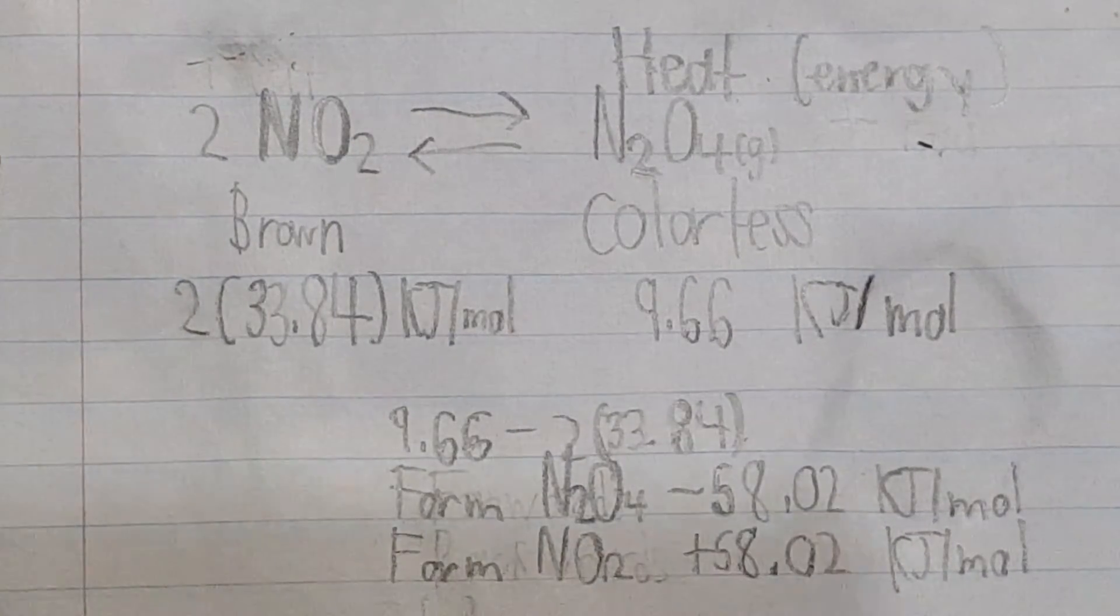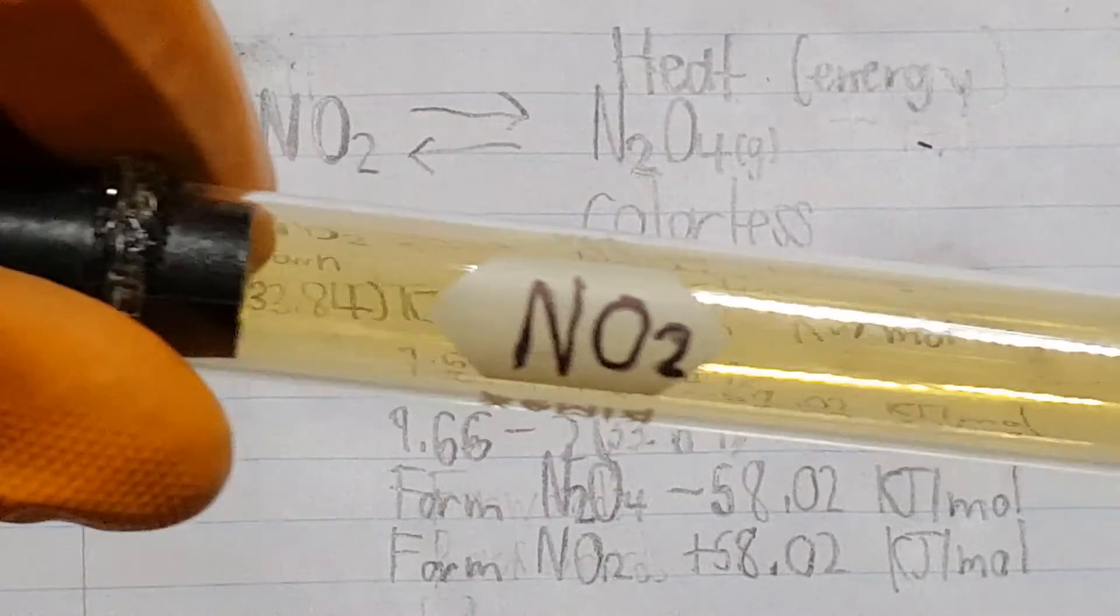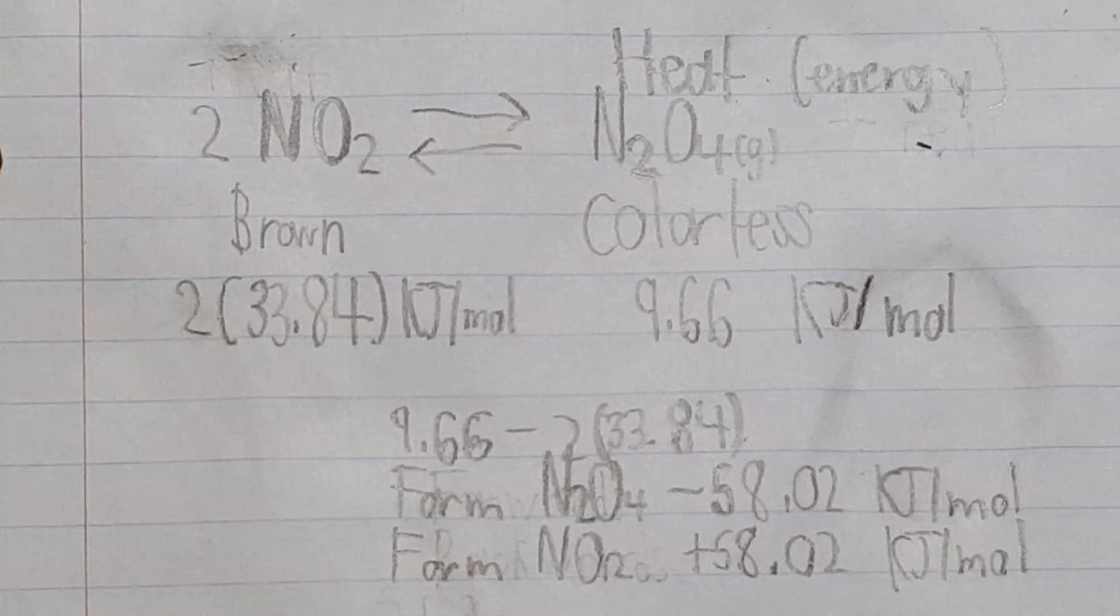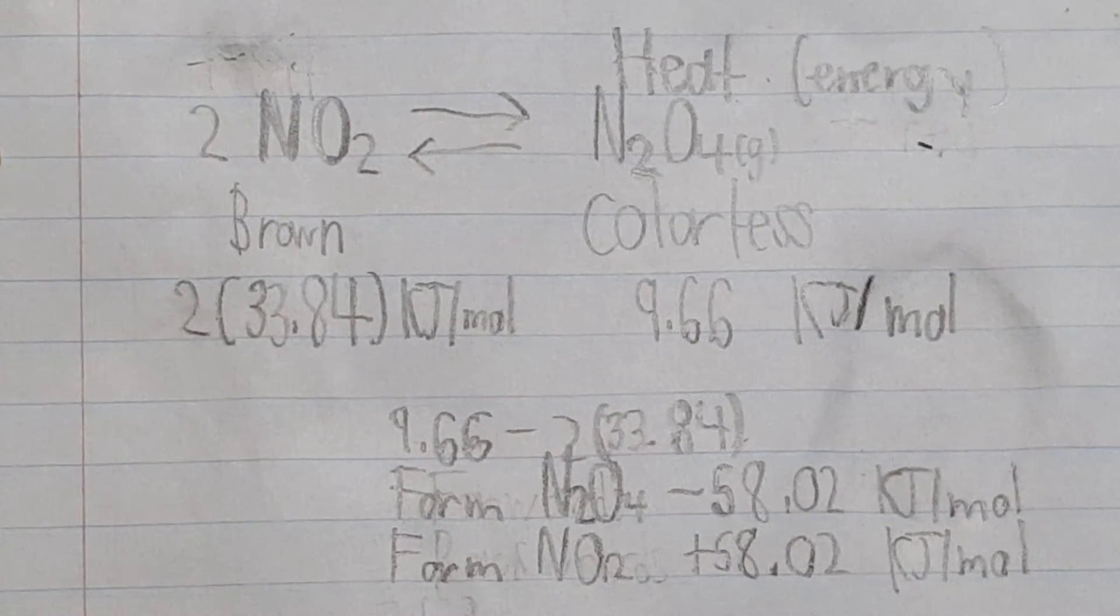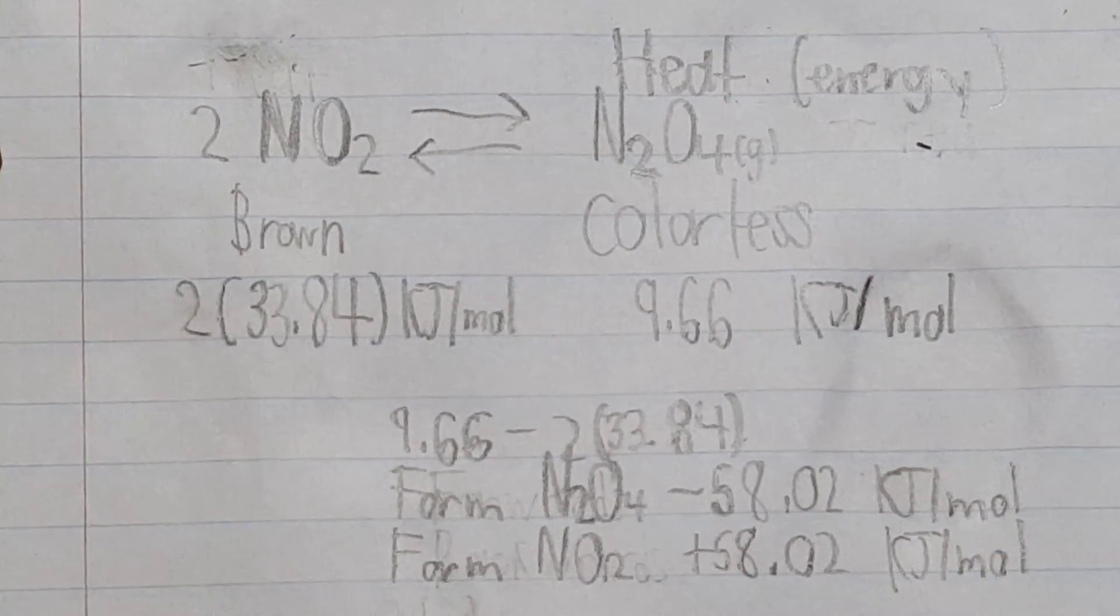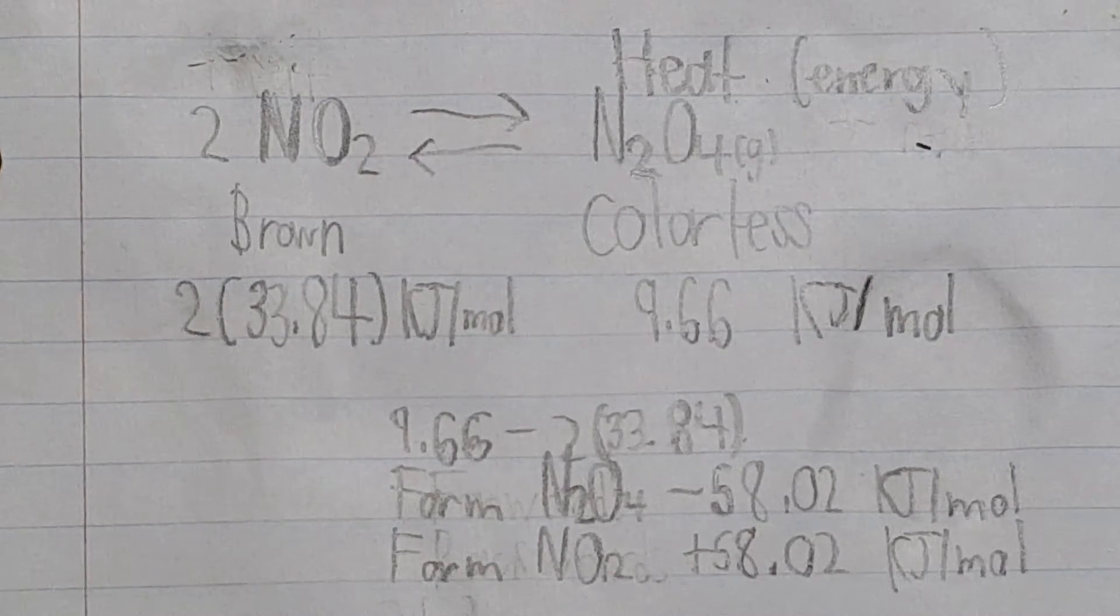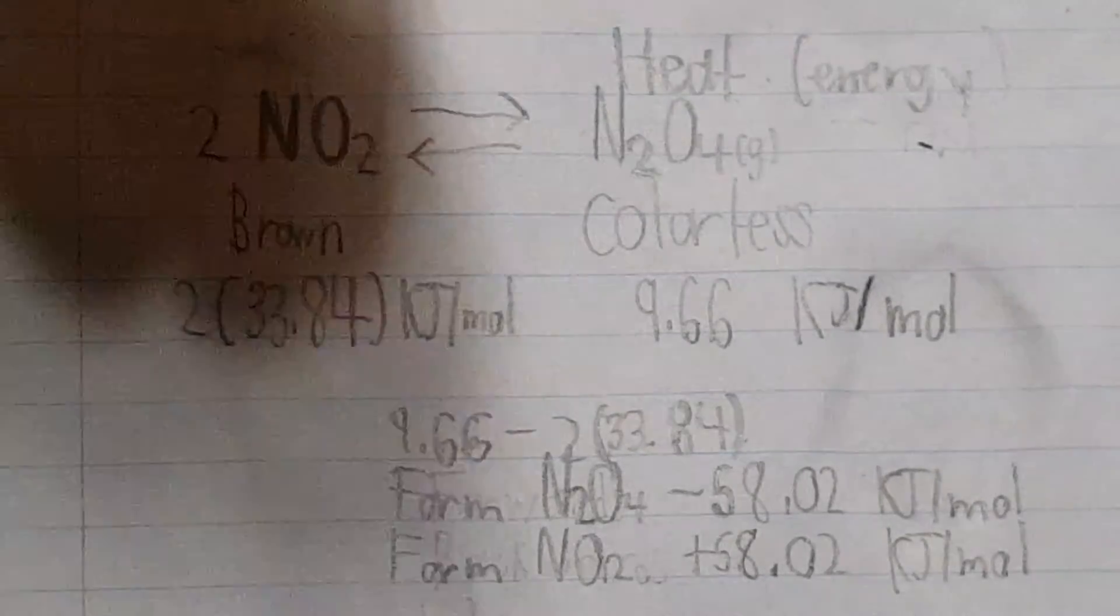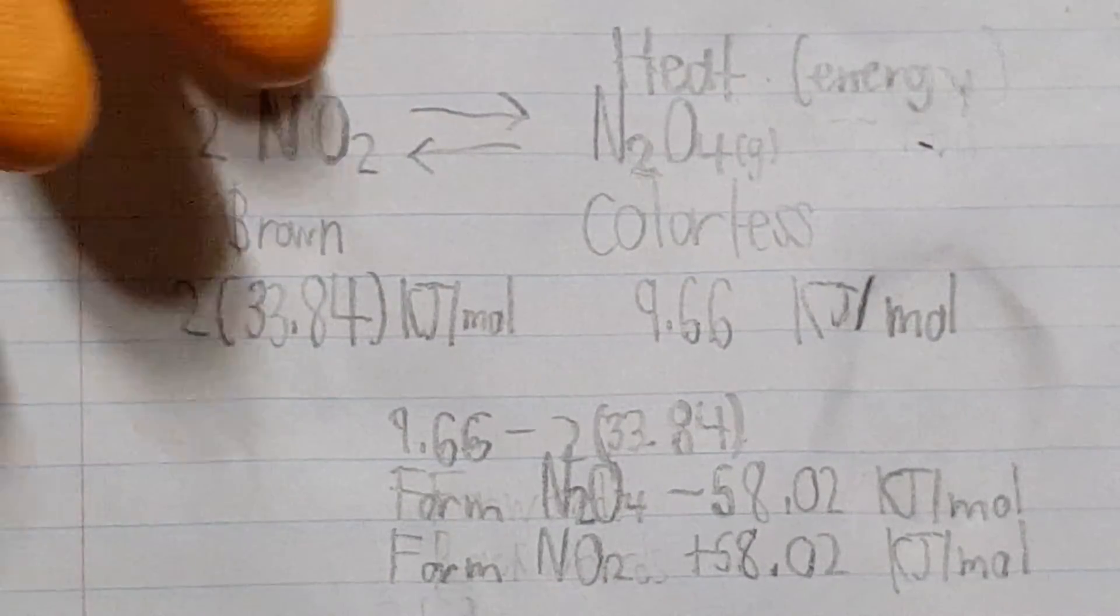So let me show you my gas sample. Here we go. Here it is, sealed in the test tube. Alright, so what I'm going to do here is add and remove heat to change the equilibrium to make more dinitrogen tetraoxide, thereby turning our system towards the colorless side, and to make more nitrogen dioxide, turn more towards the brown side. Dinitrogen tetraoxide is colorless, nitrogen dioxide is brown.